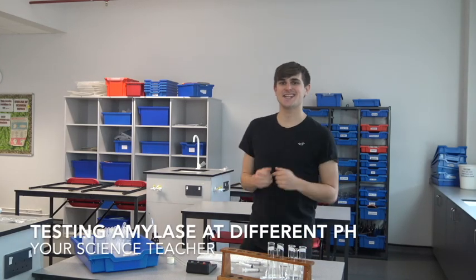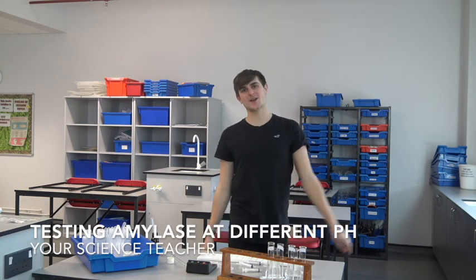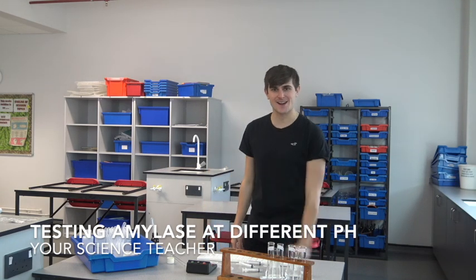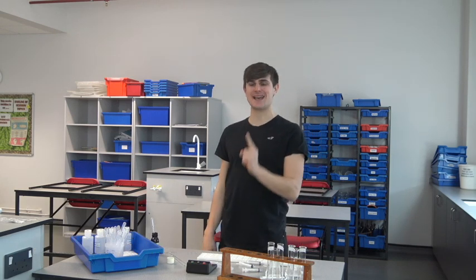Hi guys, it's your science teacher here with another required practical. This time I'm going to go through enzymes and looking at what pH an enzyme works best at.